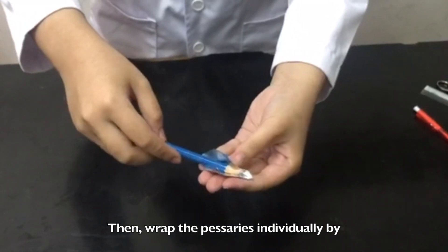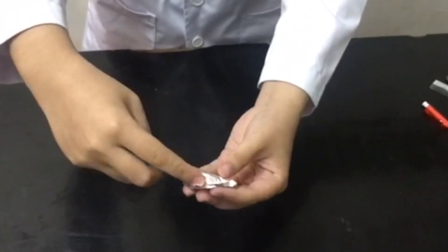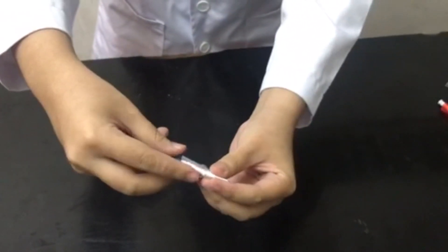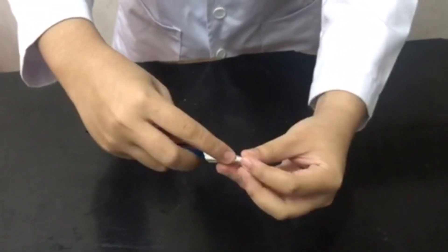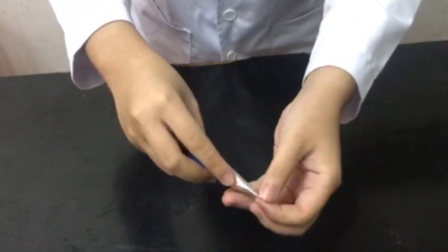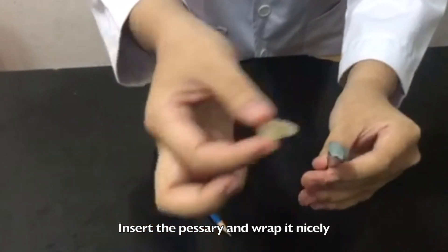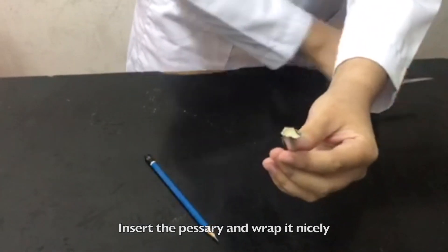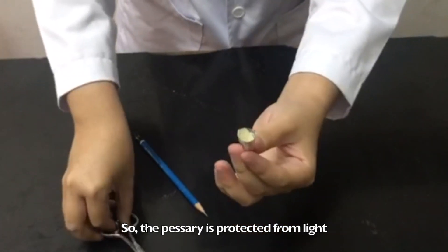Then, wrap the pessaries individually by using aluminium foil. Use a pencil to guide you to make the wrappings. Insert a pessary and wrap it nicely. We need to use aluminium foil so that the pessary is protected from light.